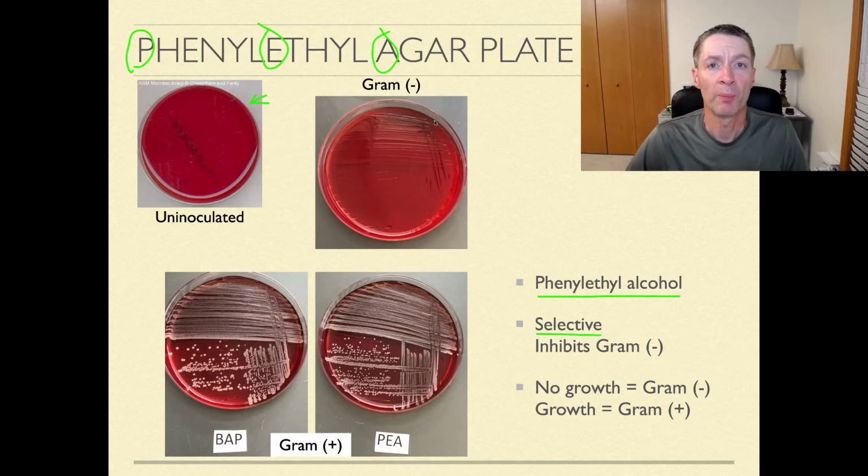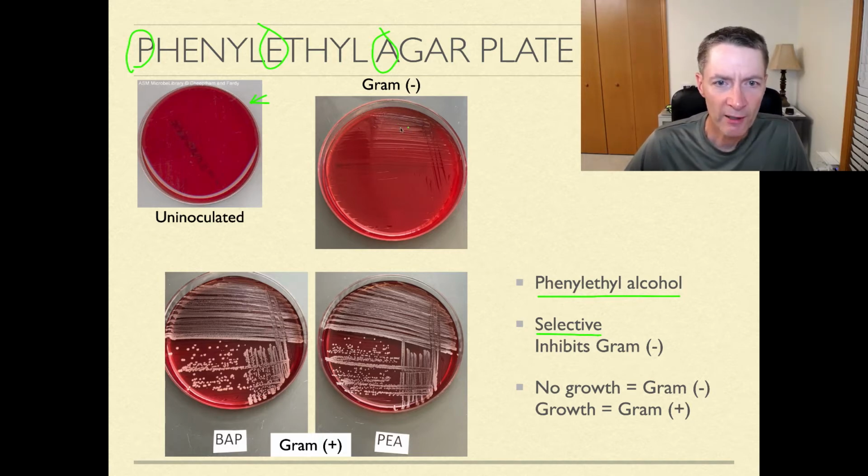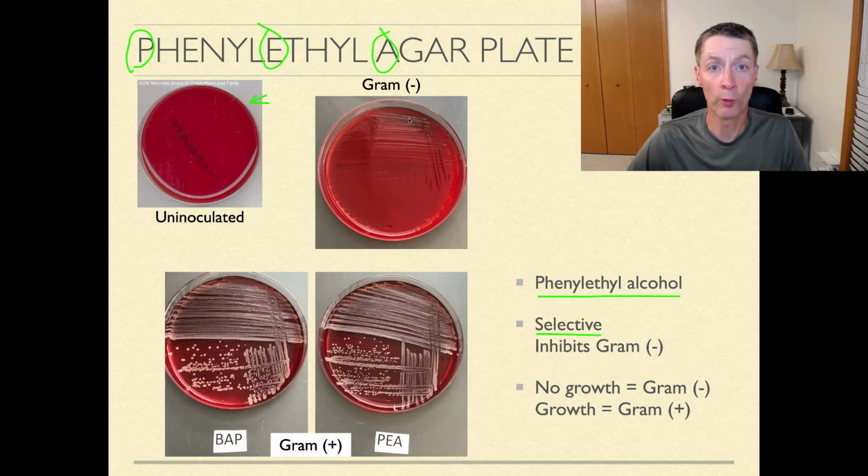And if we were to place a gram-negative organism on this plate and do a streak plate on it, you can kind of see this back and forth look, like it's been scraped a little bit with an inoculating loop. Well, this has already been inoculated with an organism, and yet it looks very similar to the uninoculated version. That's because none of those cells stood a chance.